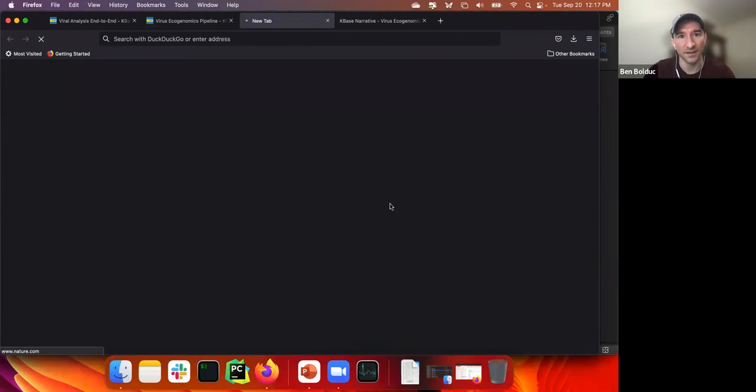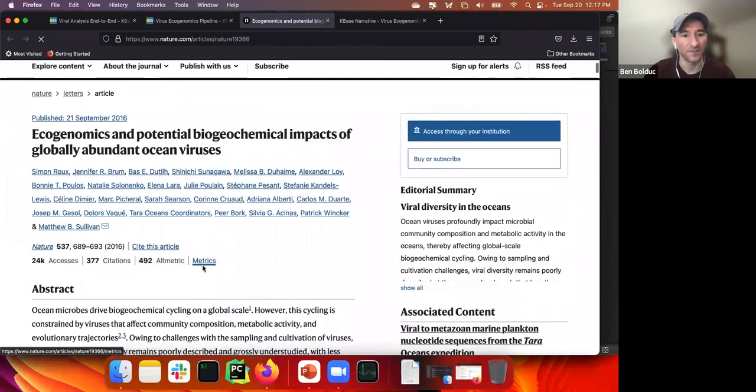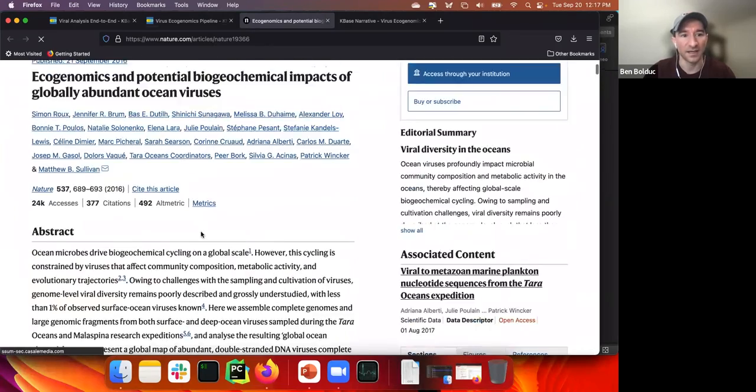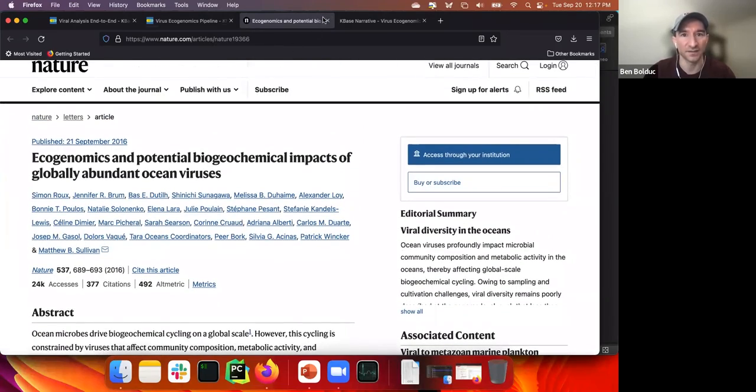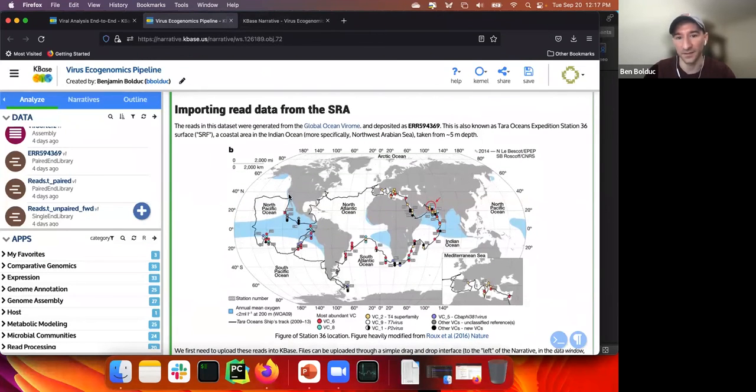Is this going to take a new thing? Yes. No, accept all cookies, whatever. You can actually look through. Of course, I need to sign in. But yeah, you can go through all these citations and read about the data that we're downloading here.